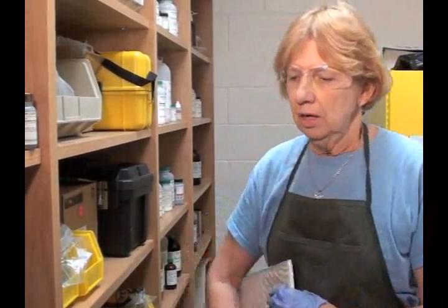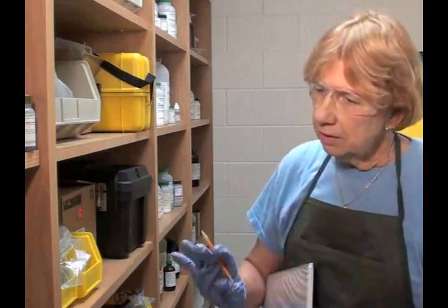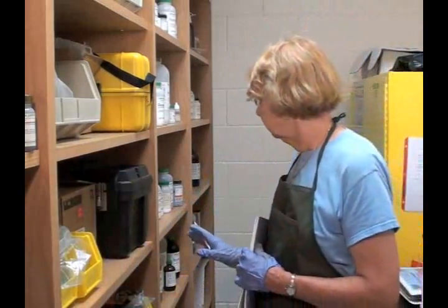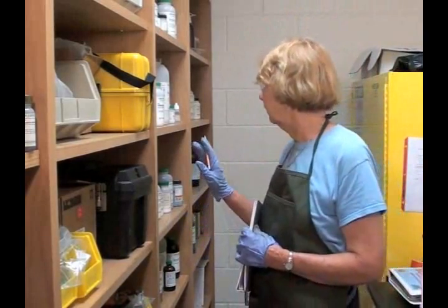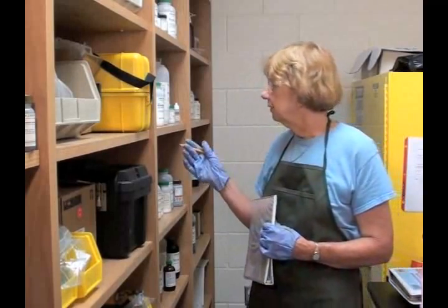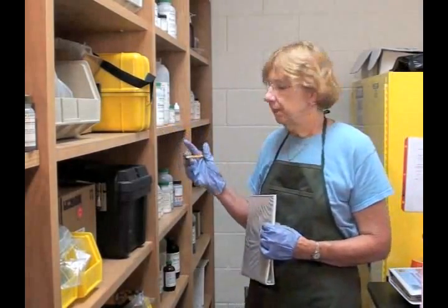You should have either a Flynn system, which many teachers use, ChemSafe has a system, Fisher does. It really doesn't matter which one you use, but it should be used. It appears to me from just looking at the chemicals that he has on the shelf that his is kind of a combination of hazard class and alphabetical order.